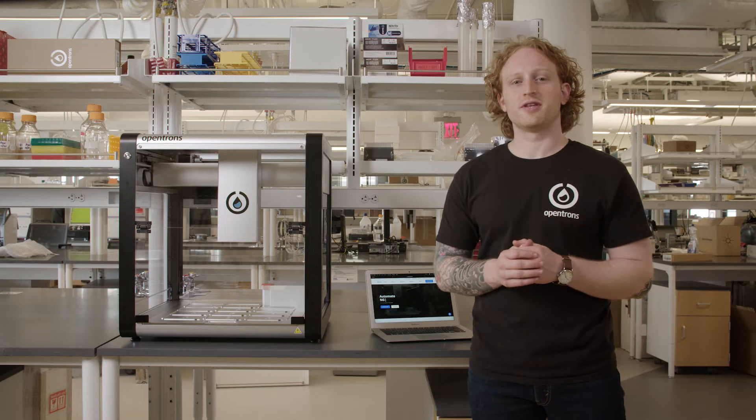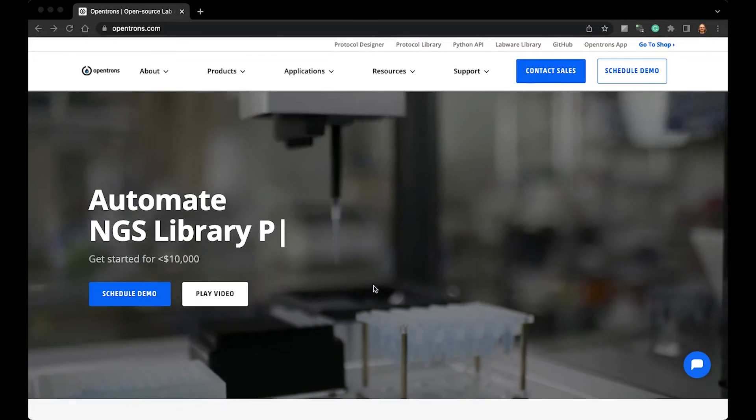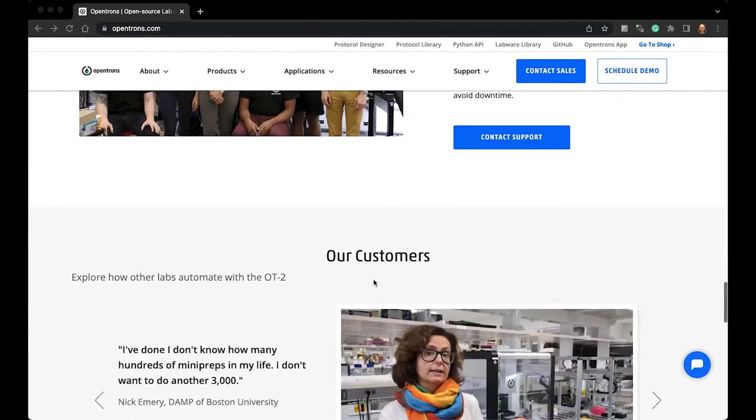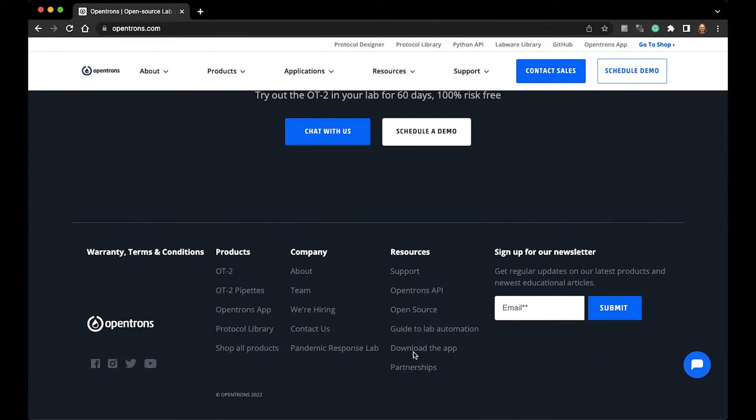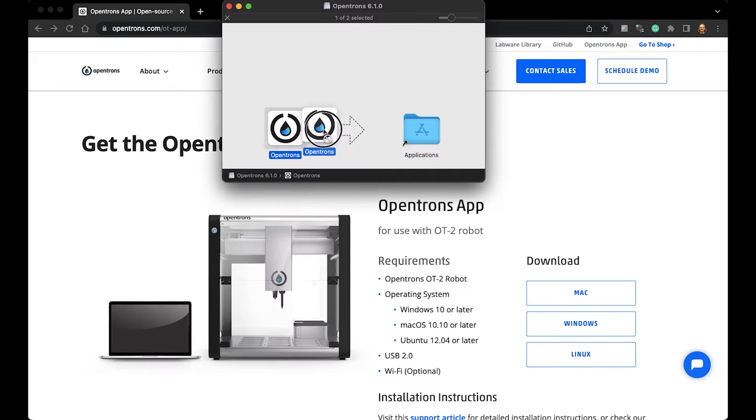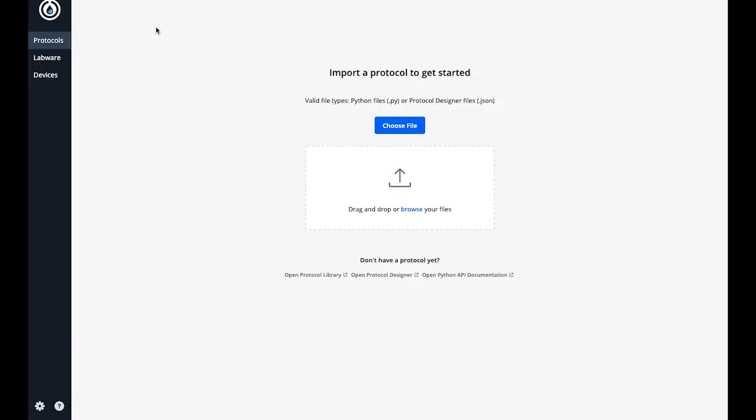Let's get started downloading the app. The OpenTRONS app can be found on the OpenTRONS website. I will scroll down to where it says download the app. I will download the OS-specific app to my computer and then follow the on-screen instructions to install the app. Once the app is installed, I can then open it.